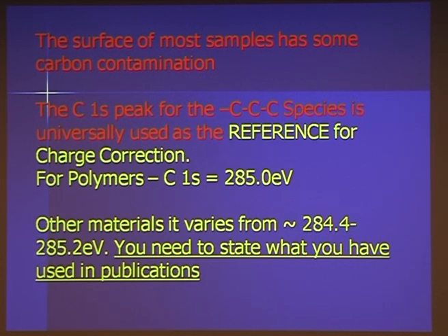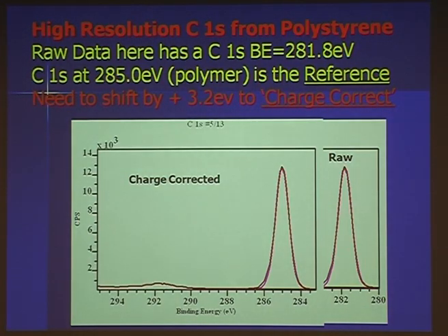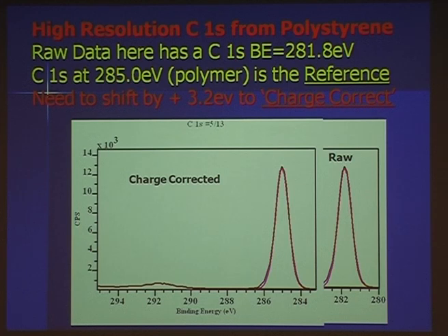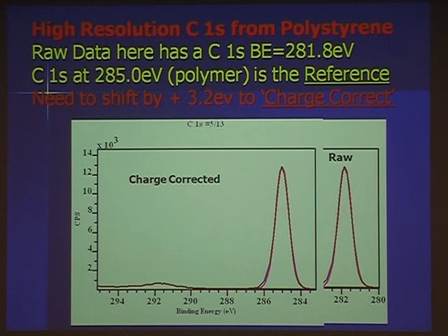They should state: 'adventitious carbon was used at 284.8' — that's important. If they don't put that in, there could be a 0.6 eV discrepancy. Here's that same high-resolution carbon 1s spectrum from polystyrene — it was coming in at about 281.8, and with the software we need to shift it up, adding 3.2 to give the charge-corrected absolute value of 285. And you shift all the peaks by the same amount — you don't shift carbon then shift oxygen differently. I've seen some people publish uncorrected data and it is so confusing.